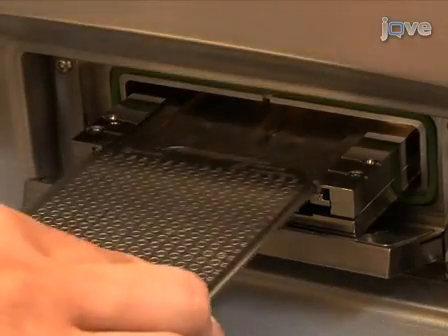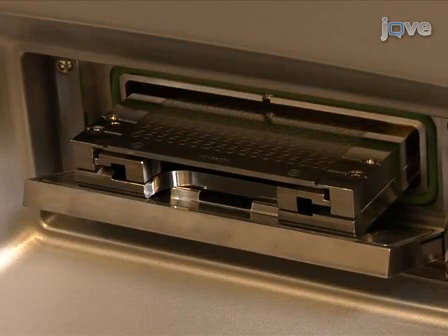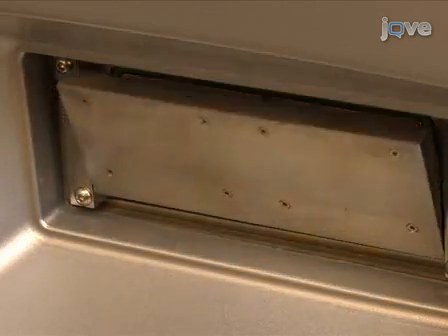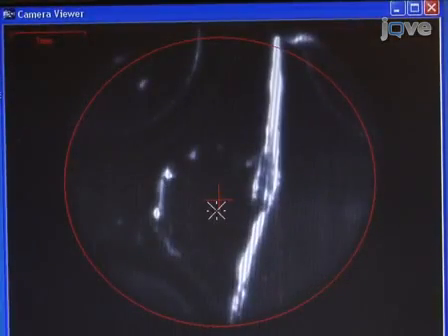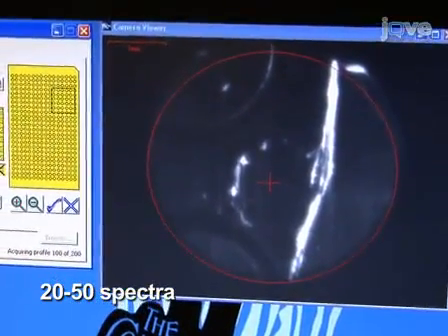To analyze the in situ samples, place the target plate, including the tissue specimen enzyme matrix spots, into a MALDI-TOF mass spectrometer. Record mass spectra using the same settings as for the isolated cell wall sample. Start firing the laser onto the matrix sample crystals next to the tissue. Make sure not to hit the tissue itself, as in such a case the time of flight of the molecules will be off. Collect around 20 to 50 spectra per spot and compile them to generate a representative average spectrum.